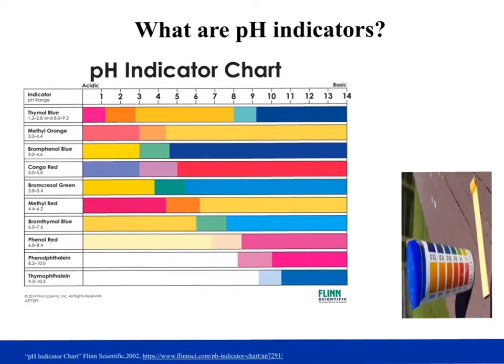For phenolphthalein, it goes from clear at a more acidic pH to a more hot pink at a more basic or higher pH. The ideal spot for phenolphthalein is that lighter pink color in the middle, which is about pH 8 to 9, which is where the equivalence point will be. Don't worry, you don't need to memorize the information in this table. However, you will need to be able to interpret information provided like this to determine what a good indicator would be for a titration that would have an equivalence point at various pHs.